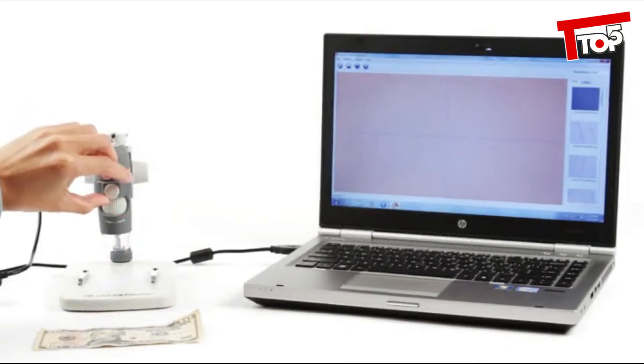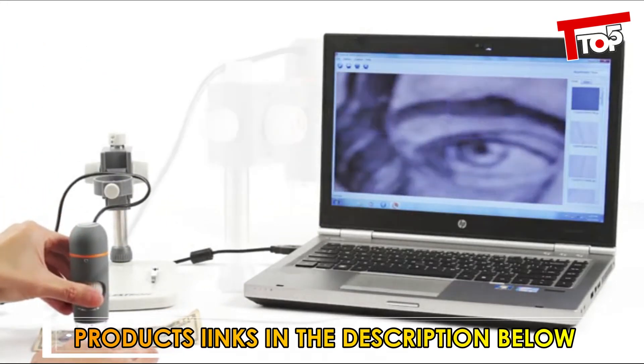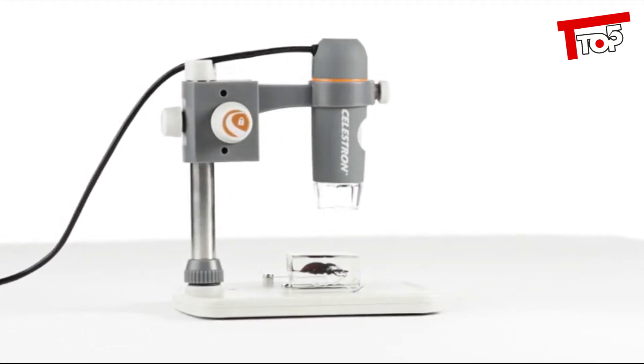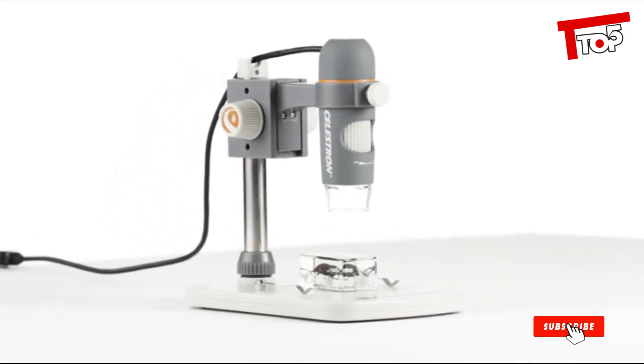The microscope smoothly detaches from the stand so you can use it in handheld mode for closer views of your specimens. For high quality views and recordings from the workplace to the classroom, you can't beat the versatility, quality, and ease of use of the 5 megapixel Handheld Digital Microscope Pro from Celestron.